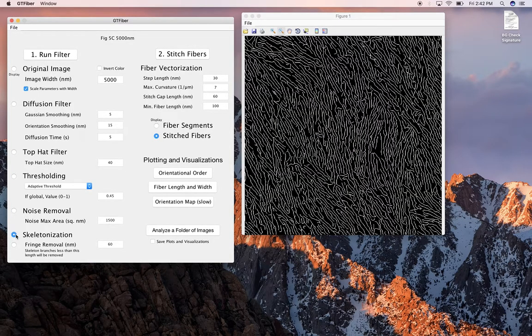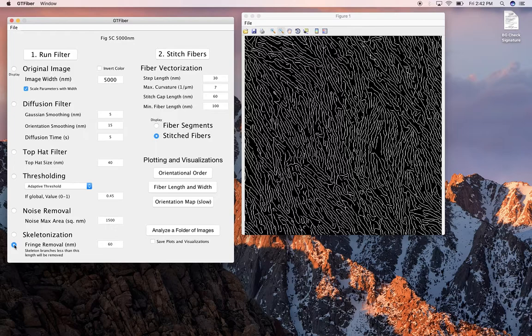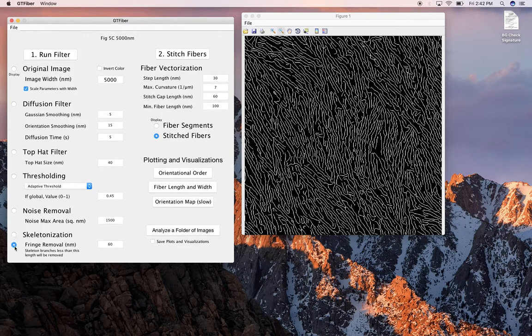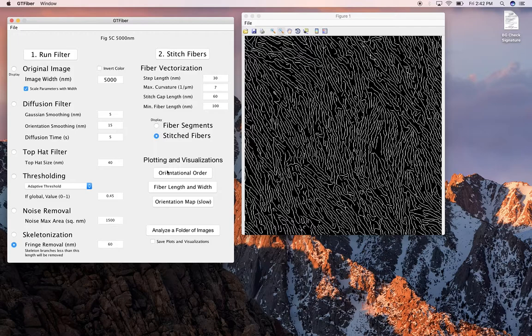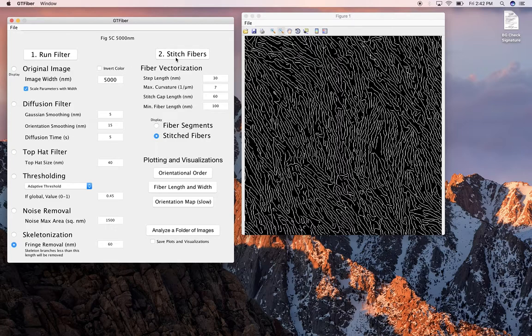From there we do skeletonization, which I think I already showed, thins out the image to a single pixel width. And then fringe removal gets rid of these kind of like spurs in the skeleton. Although that's been fixed quite a bit. These are really fine-tuning things. For measuring orientational order, it's not quite as necessary. They really have almost no impact. But for measuring fiber length, they can have a pretty significant impact. Okay, so this is a good starting point for stitching our fibers, which we now do.